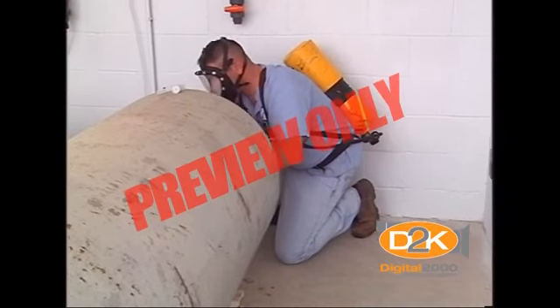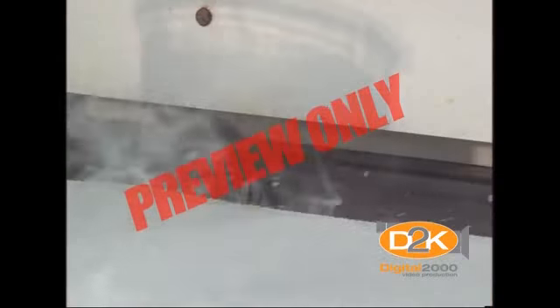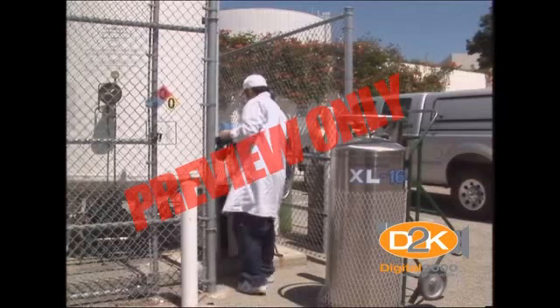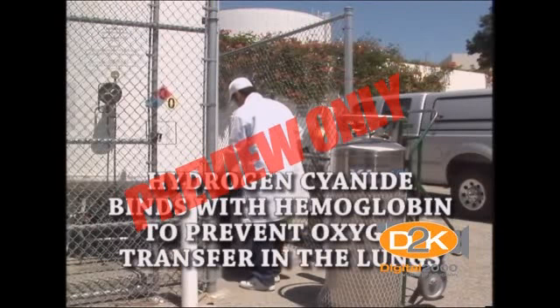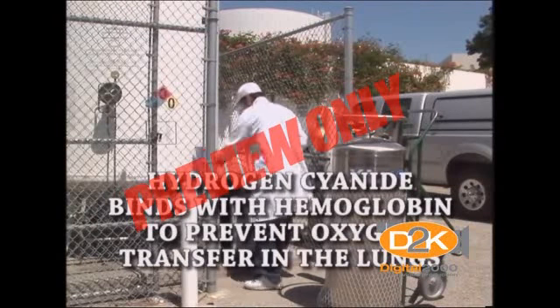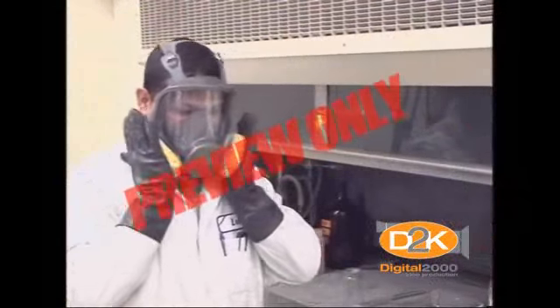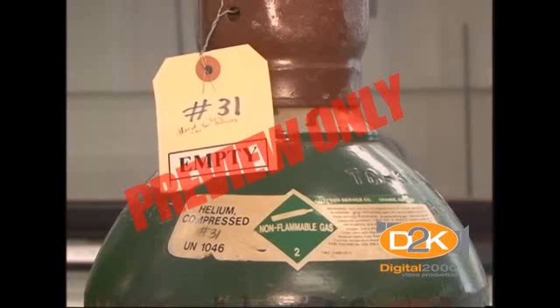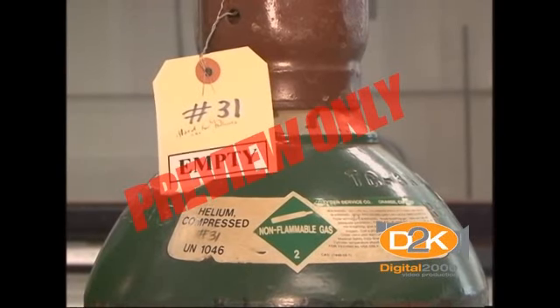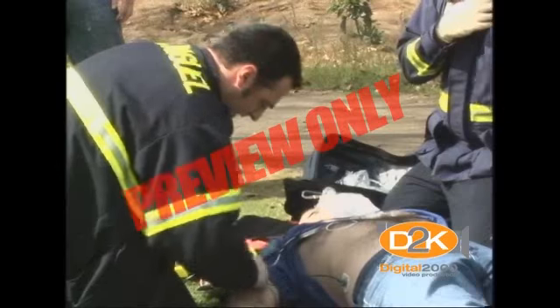Asphyxiation is oxygen deprivation due to oxygen displacement in the environment. Asphyxiation can also be caused by chemical effects on the body. For example, hydrogen cyanide binds with hemoglobin to prevent oxygen transfer in the lungs, which can cause asphyxiation. Simple asphyxiants are inert gases which displace oxygen in the environment. Examples of simple asphyxiants include nitrogen, carbon dioxide, and helium.